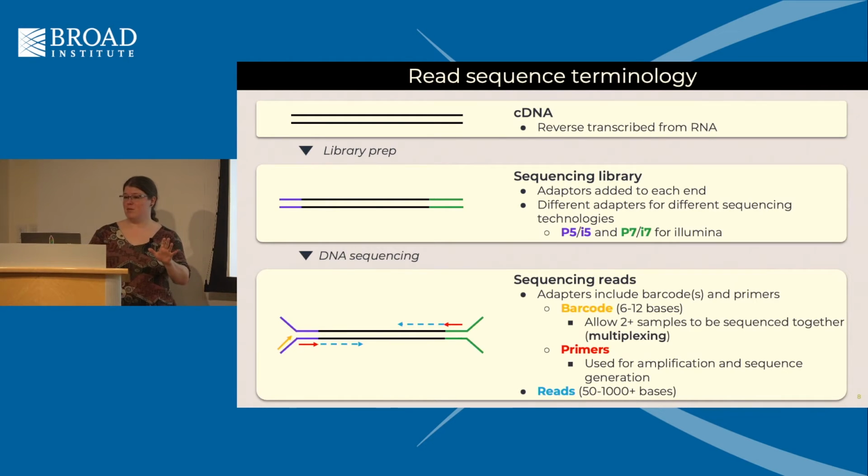I mean, they let me publish it, so I'm gonna assume it passed that particular aspect. But if you can get longer reads, your ability to align to the genome will be better. So to get at your question from another perspective, and this is actually not just RNA, it's more generic to all sequencing data. If you play around with the UCSC genome browser, you can get a unique alignment with a primer pair using 18 to 22 base primers, depending on the part of the genome you're trying to get at, assuming there's lots of repeats.